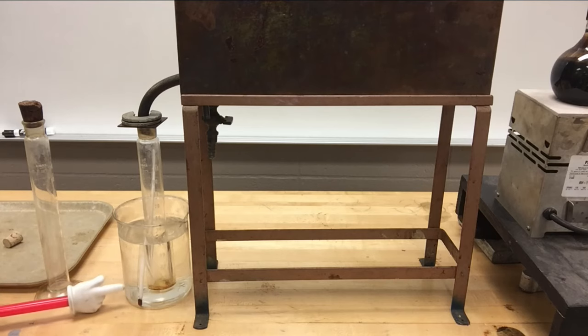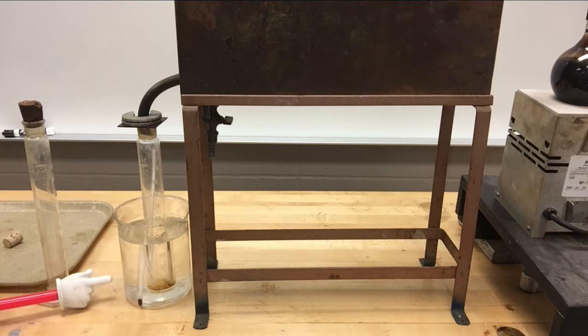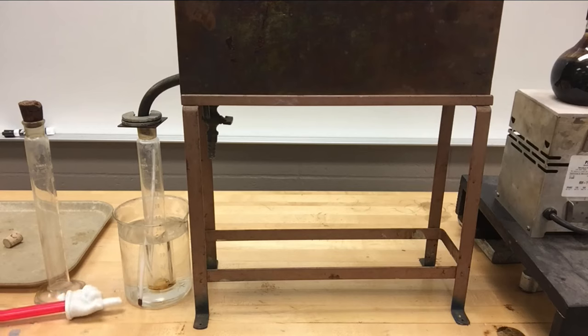I'm getting closer to 300 degrees is where I'm at right now. And as I got to 300 degrees, again, we're seeing it going drip, drip, drip, quicker and quicker. So I'm going to say at 250 degrees, we had maybe 3 milliliters of gasoline/naphtha on it. We're a little bit over 300 degrees right now. So at 300 degrees, maybe we'll call that 5 milliliters.